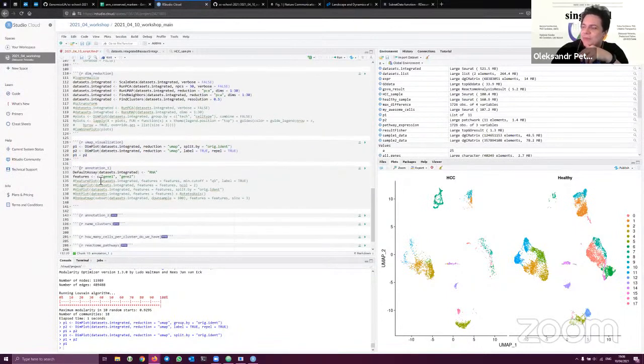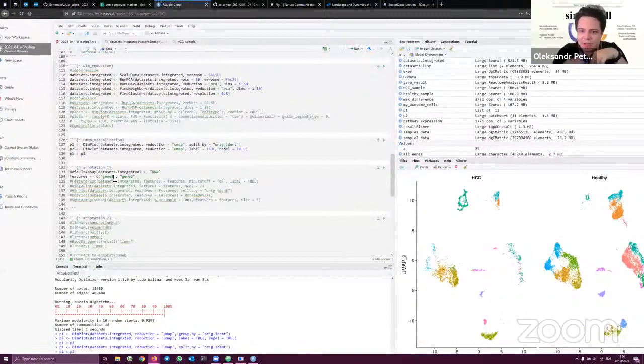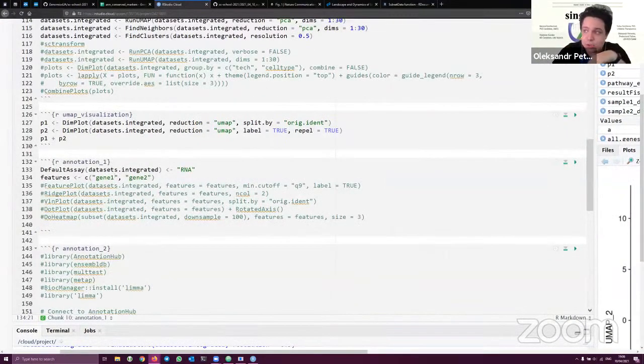Super, thanks. So next will be a little bit interactive. So this step will be interactive. We have 18 clusters, but we have 0 ideas for them. So I will ask a few persons, if it's possible, to help me a little bit. I will ask Marina, Andrea, and Tatiana. Please open Google, and I will ask the 3 of you to Google human cell markers for specific cells. Please, Marina, Google Kupffer cells.